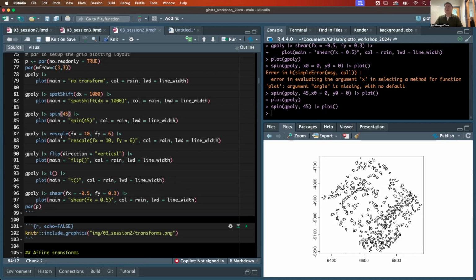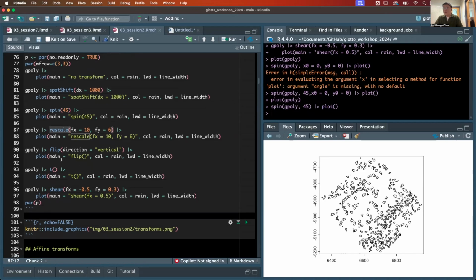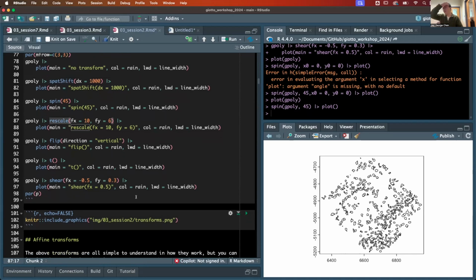That's also something to watch out for with rescale, because it's usually going to expand away from the center of your item over here instead of from the 0, 0 value. And I guess it's also something you would think about a little bit for flip, but by default, flip actually does go around from 0, 0. So just keep that in mind, and maybe it's something we should update the defaults for in the future as well.